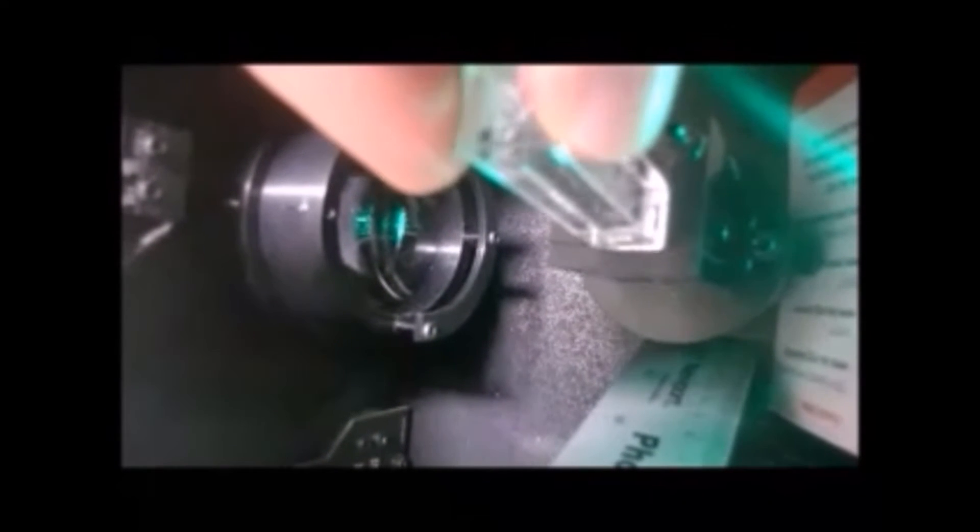Let us look at our first sample, which is water. As you can see, not too much happens. Most of the light doesn't interact with the water at all and just passes straight through hitting the piece of card, as before when we didn't have a sample in the sample compartment. You can see some slight scattering in the water, but you need to look close.